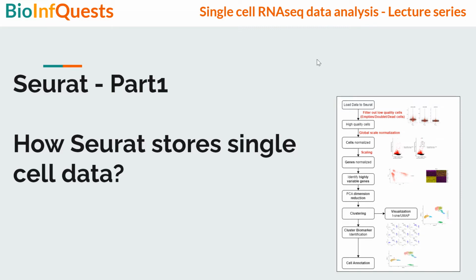In this video, we will explore Seurat. Seurat is a popular R package which is widely used to do the downstream analysis of single cell data. It is used after CellRanger.